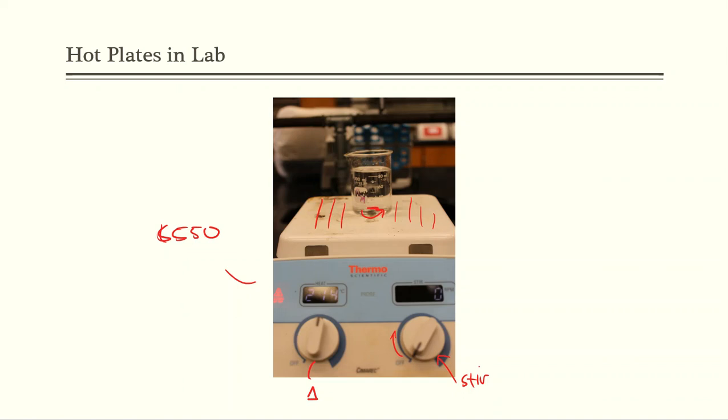I was just heating water. So that's why you're seeing that this is in the position of off. So I've cranked this up and I'm beginning to heat this ceramic top, which will then heat my water inside of the beaker. This temperature doesn't mean anything, therefore I never want you to record that. This temperature kind of refers to the temperature of the top, not the temperature of the solution.